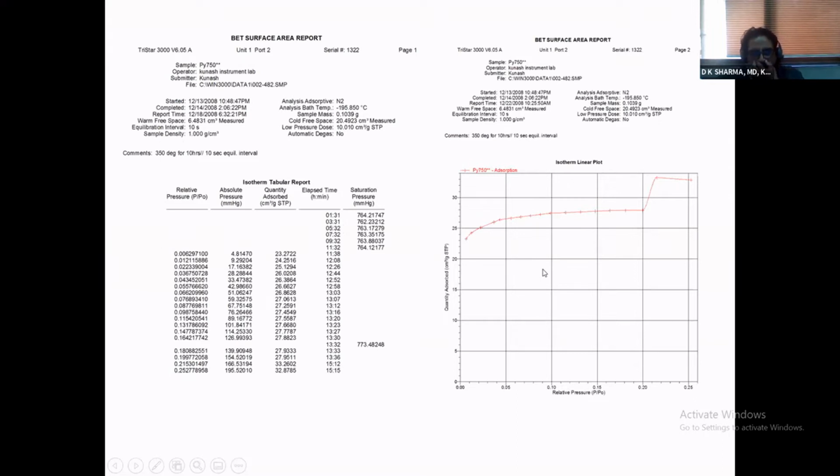You should expect a big error in this case. An unequilibrated isotherm you will find is quite narrow. A fully equilibrated isotherm should be slightly broader. Let me see if I can show you some isotherms.